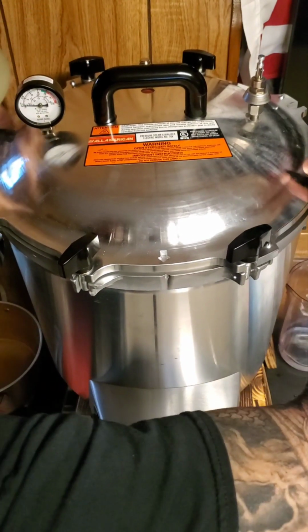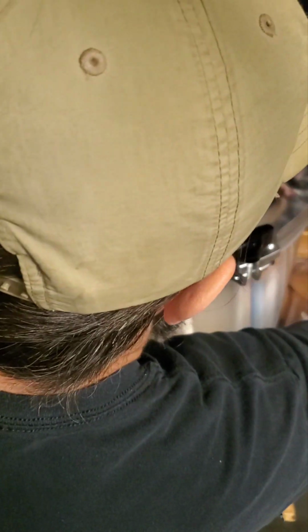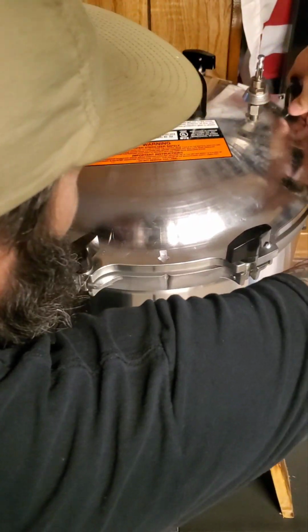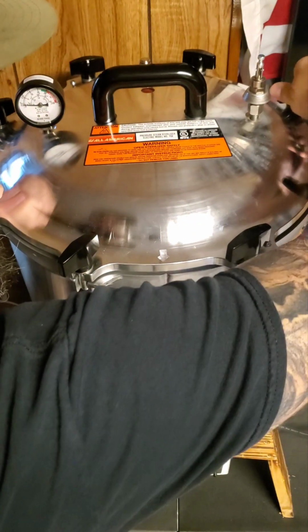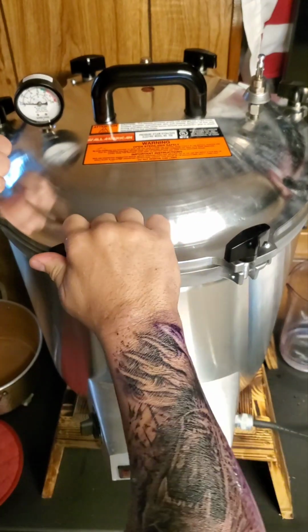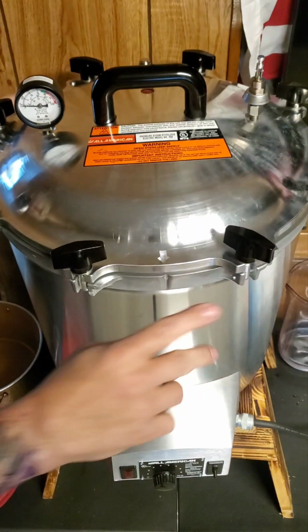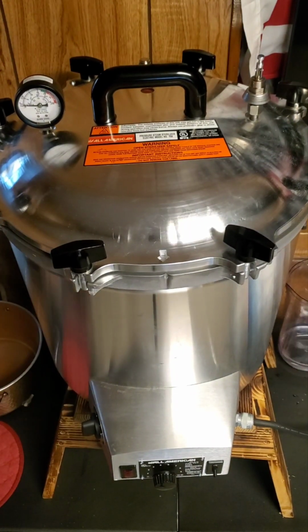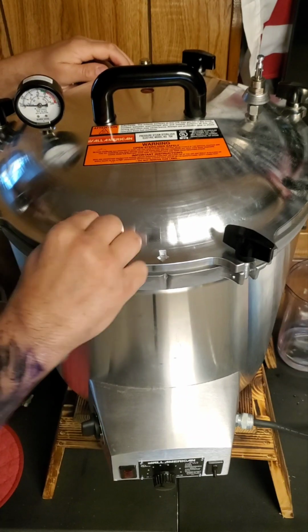And I'm just putting these kind of like barely tight right now until I get them all on. And plus, I like to make sure they don't fall off because these wing nuts will screw all the way off. And still keeping a towel on standby for when this happens. But we'll go through this whole process here. So now that we got all these on, we're going to tighten them together. But I like to look first because it's really easy for me to tighten them more with my left hand. And it kind of goes this way on its own.